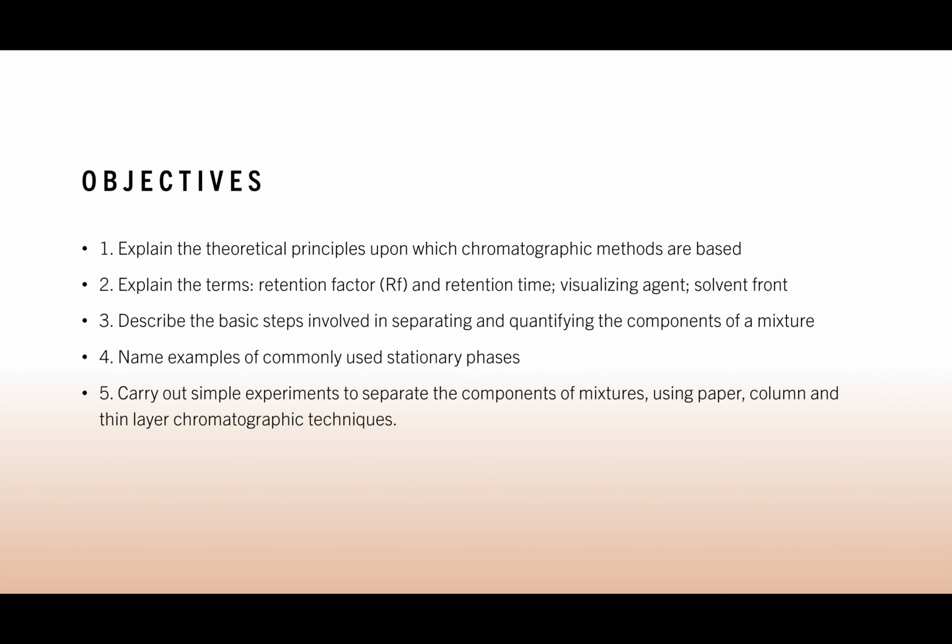Name examples of commonly used stationary phases, and carry out simple experiments to separate the components of mixtures using paper, column and thin layer chromatographic techniques. In this PowerPoint as well, I put in gas liquid chromatography, GLCs, just have a look at that. It's just some extra information there.